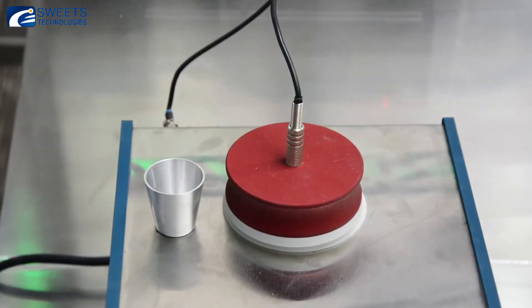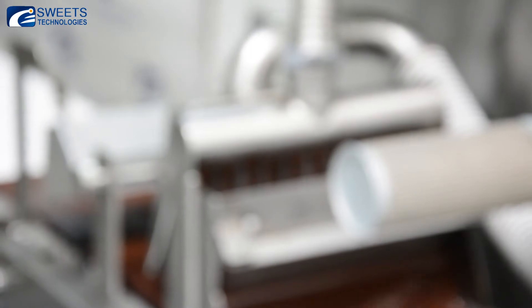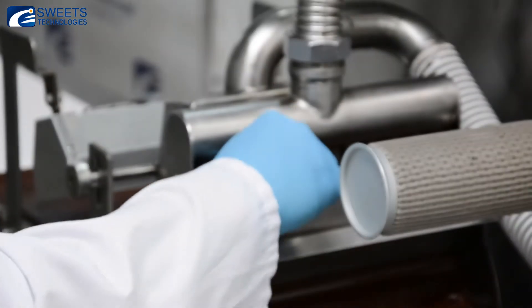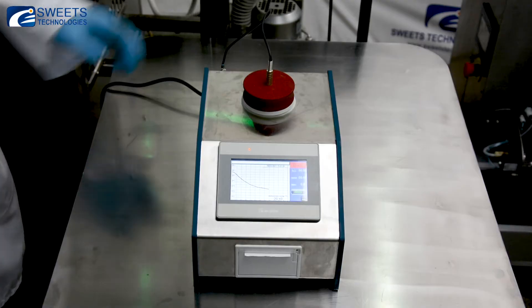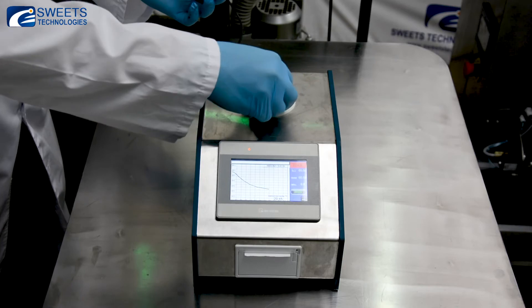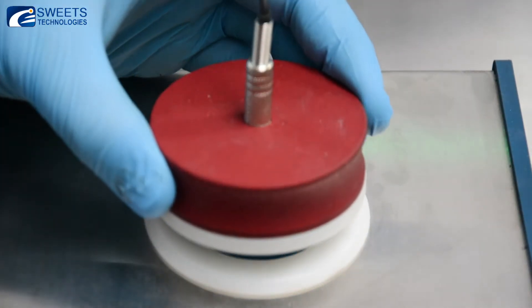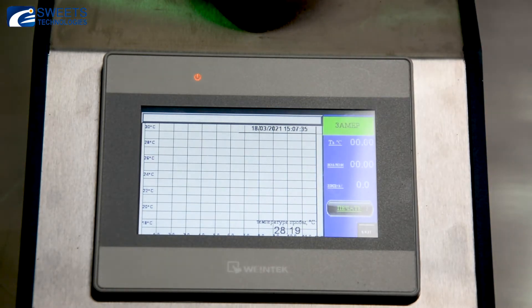The tempered chocolate mass in the amount of 8.5 milliliters is collected into the sampling container. The sample is placed in a thermostatic cooling chamber, covered with a lid with a built-in temperature sensor, and the start button is pressed on the touch control panel. Temperature curve measurement time is from 6 to 8 minutes.